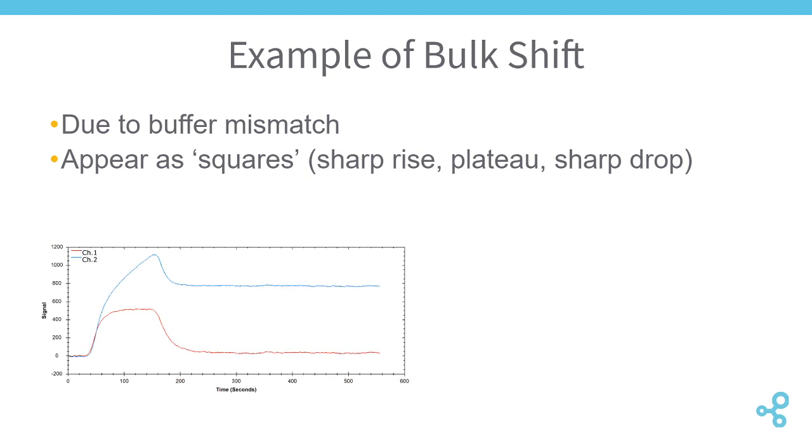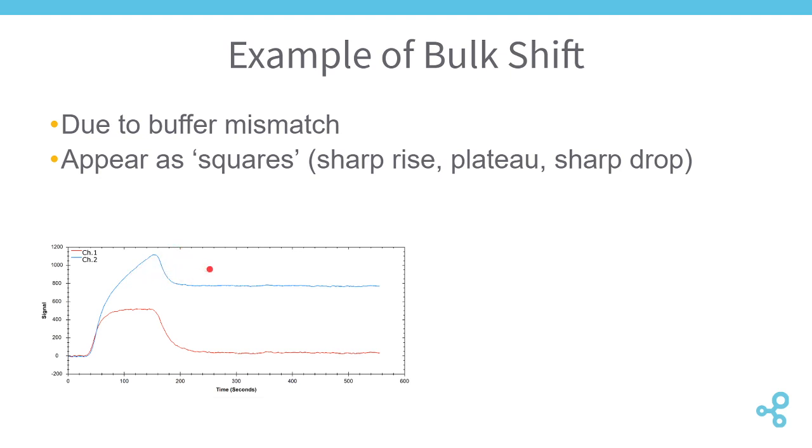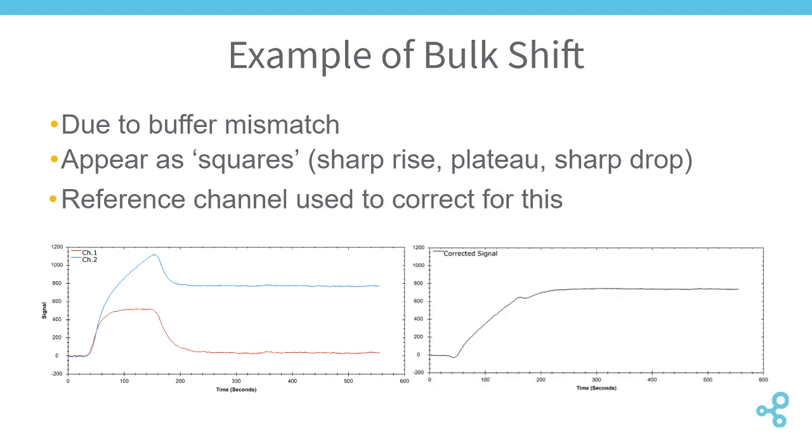So what would this look like if we actually performed an analyte injection over a ligand-bound surface? What we'll see is what we see in this blue response here. We have what looks like a response curve, but at the end here we have what looks like a disconnect in the data as we're coming back down to our dissociation phase. Again, this is due to that bulk shift that is present in our sample conditions. If we do have a 2-channel instrument, this can be referenced out. That's why we say it's not always possible to fully match our running buffers and analyte sample buffers, and this is why that reference channel would be important. Now, if you are using a 1-channel instrument, then it is imperative that we remove that bulk shift completely from our analyte samples so that we don't have any of this false positive data when we fit our data after our experiment is complete.